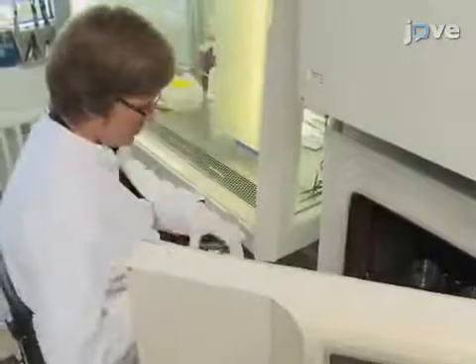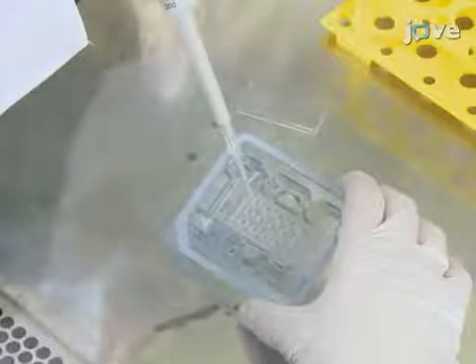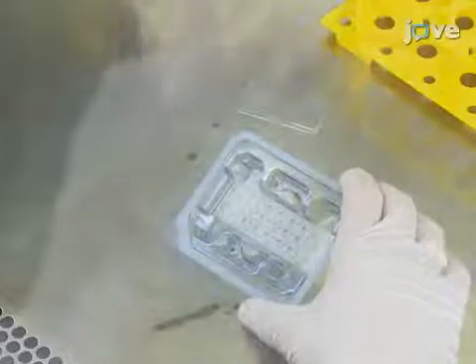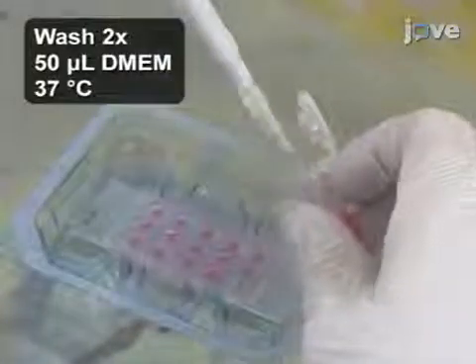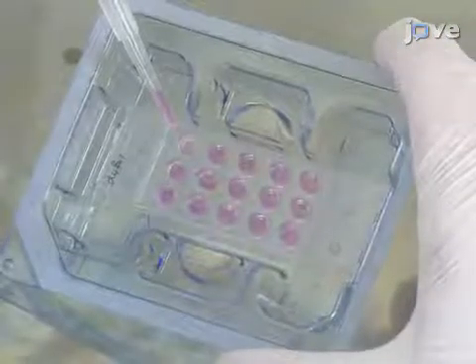After the incubation, aspirate the supernatant from the wells while holding the plate at an incline, so the pipette can gently suck out the solution without touching the well bottoms. Next, wash the wells twice using 50 µL of warm culture medium. When removing the washing medium, use gentle suction.